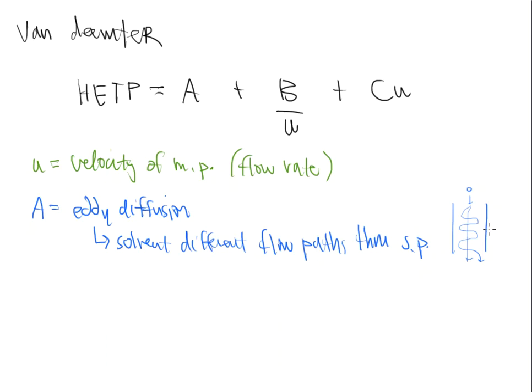Again, think of it as the interstate or think of it as the back roads. Which one do you want to do for that particular day? Some of us like one route over another, and molecules are the same way, and we call that eddy diffusion. Different paths through the stationary phase, and they do this at random, right? We've got no control over that.